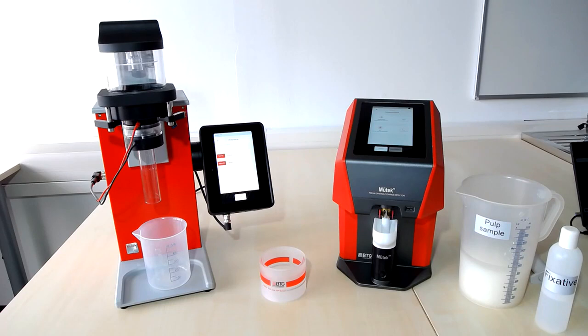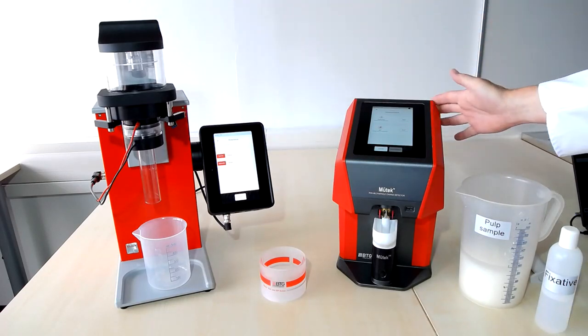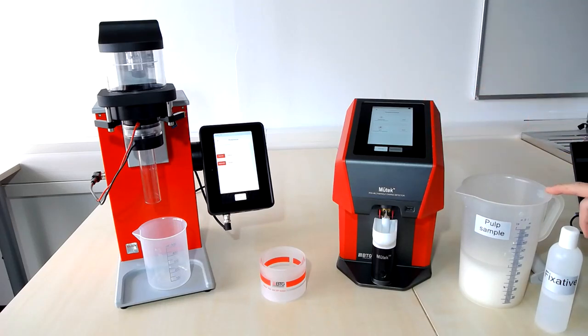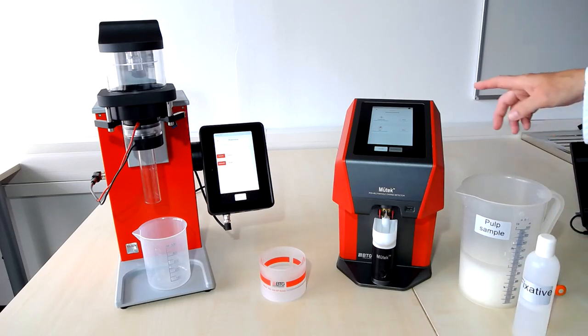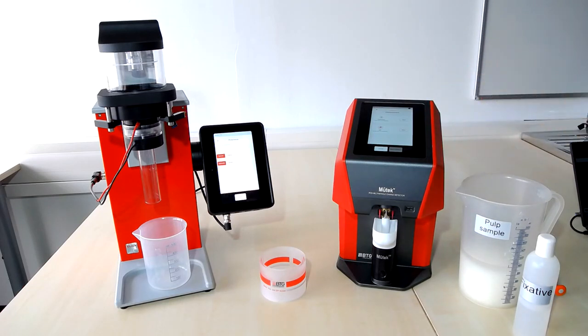I've set up for you an SCP-10 to measure the fiber charge, a PCD06 to measure the dissolved charge. We have a pulp sample here, and we have a cationic fixative. And what I'm going to do is to dose this fixative into the pulp suspension and then draw conclusions. We will be using charge measurements in order to judge whether our fixative dosage was successful or not.